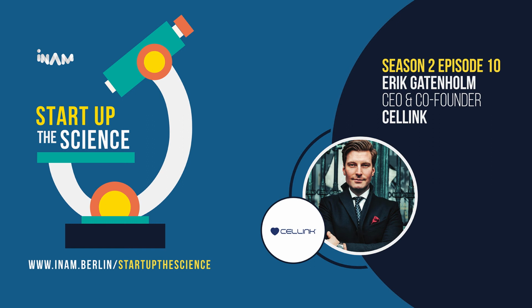And perhaps, when you get started with it, let's say you're doing your PhD, so you get started after 12, 14 months, and then you only have very few years left of doing your research on it. And then it takes you probably also 6 to 8 months to get started with these printers, because the very expensive ones, they're very, very complex and complicated to work with.